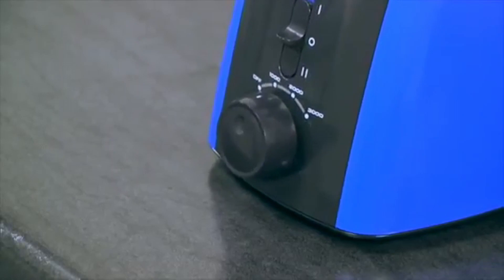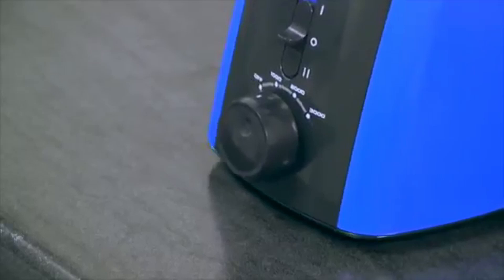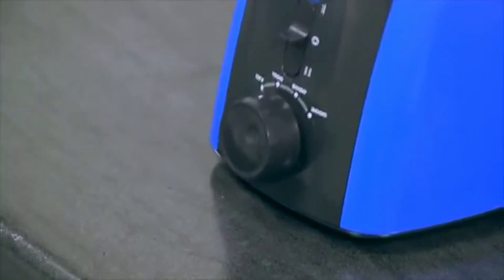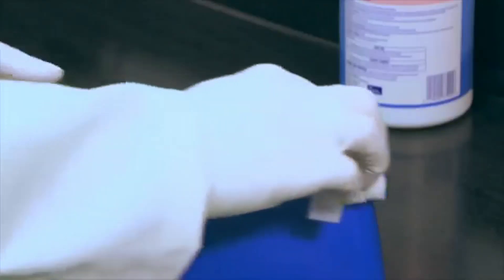The counterbalance system and soft feet minimize vibration and prevent the Vortexer from walking during operation, even at high speeds. And when the job is finished, the mixing head can be easily removed for cleaning.